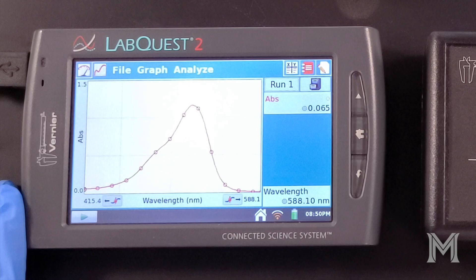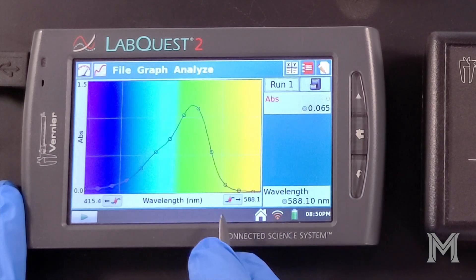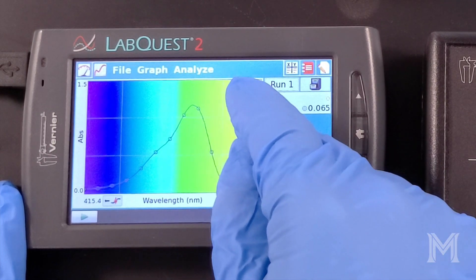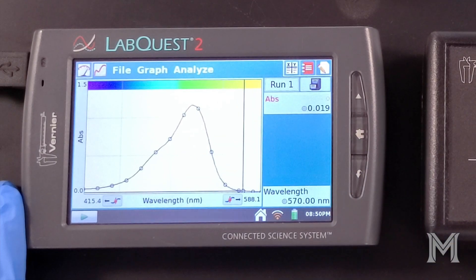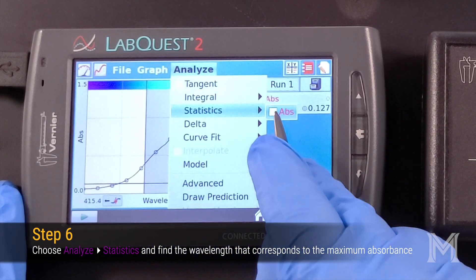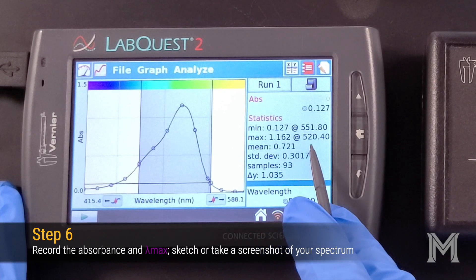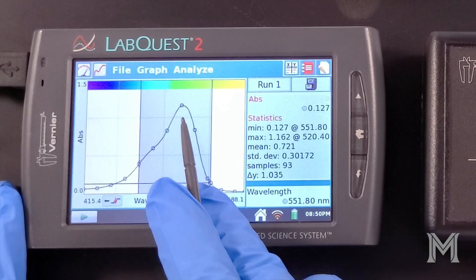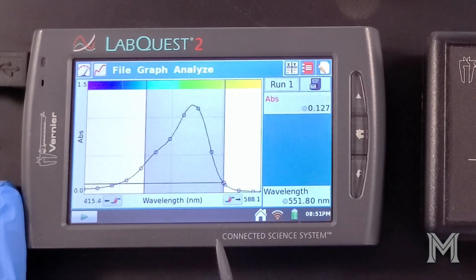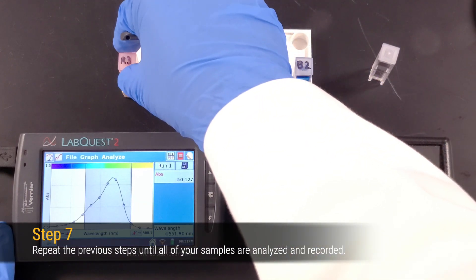To see more detail on your collected spectrum, highlight your data and select Zoom In from the Graph menu. To see which colors your sample is absorbing, select Show Graph and Show Spectrum from the Graph menu. This allows us to clearly see the absorption in the blue-green region of the spectrum. To determine the wavelength of maximum absorbance, highlight your data and select Statistics from the Analyze menu. We can see that this corresponds to a maximum absorbance of 1.162 at a wavelength of 520.4 nanometers. Select Statistics from the Analyze menu again to clear the Statistics panel.